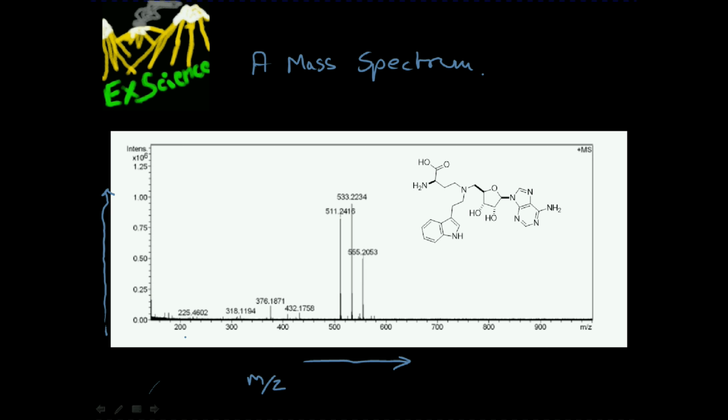The MS I have shown gives absolute intensities. However, this information may be represented as relative intensities, where if you sum the total number of particles hitting the spectrometer detector and define this as 1 or 100%, the peaks will be given as fractions or percentages of the whole value. Of course, you could just sum the peaks of interest and quote the results in terms of fractions or percentages.